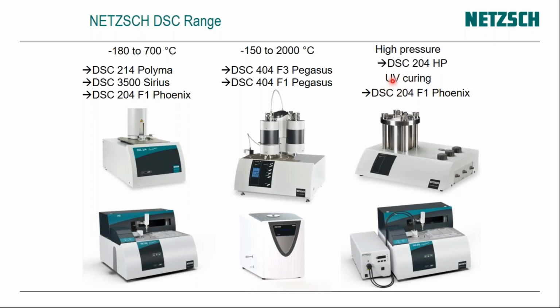So what happens is that we expose the sample. As you can see here, we have an external UV source. By using an external UV source, we superimpose the UV light onto the sample, and we see the transitions, the effects of UV light on the sample behavior. In a normal atmosphere, the sample will behave in a different way, whereas when we expose the sample to UV light, the sample properties will change, and those are the studies we can do by connecting the DSC to an external UV source.